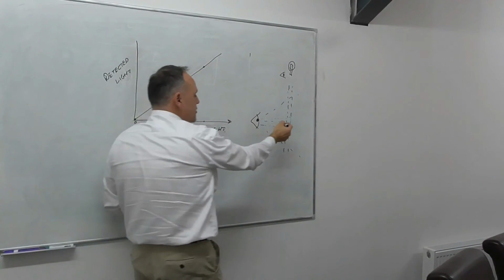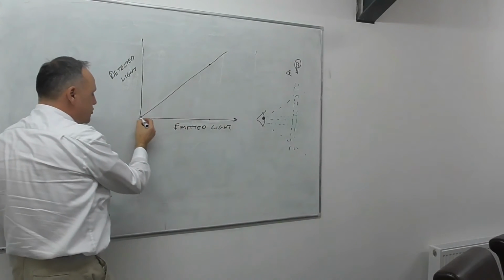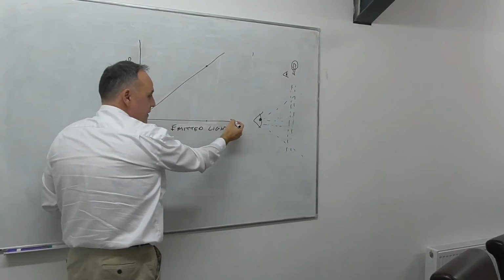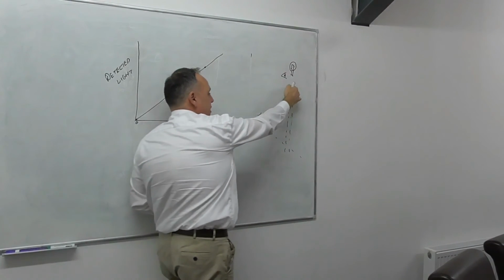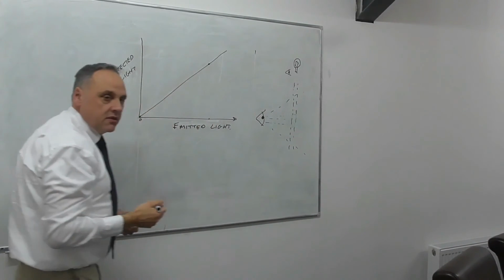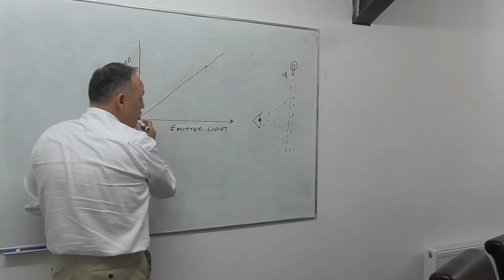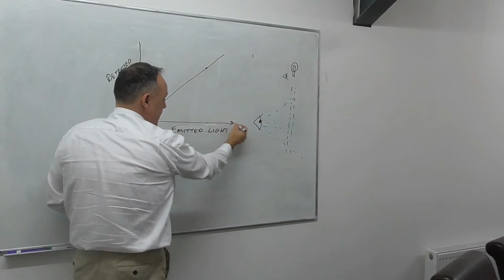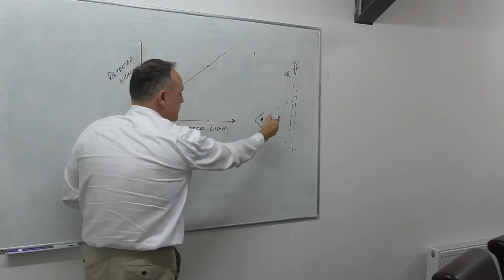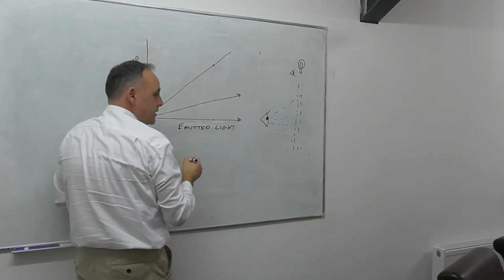Now, if there is no turbidity at all, if I draw it on that graph, I'm drawing the axis. Because it doesn't matter how much light I put out of here, if there's no turbidity, I'm not going to make an effect. I'm not going to get any light at my detector. So no turbidity is this axis. If I put some turbidity in, I create another line on the graph.